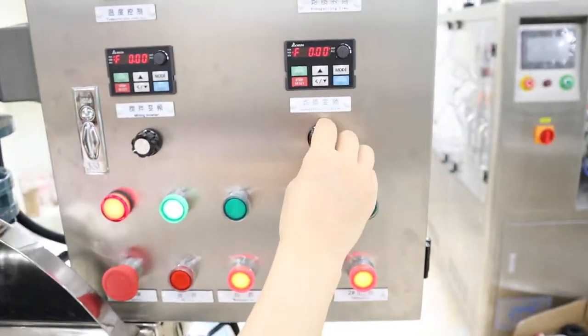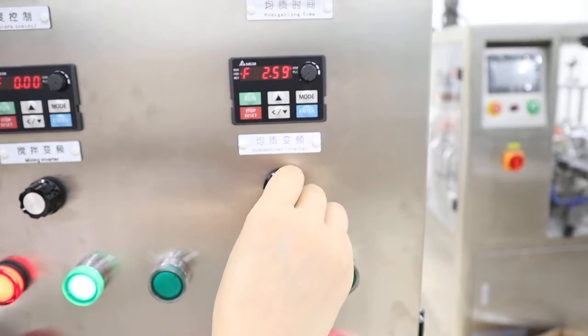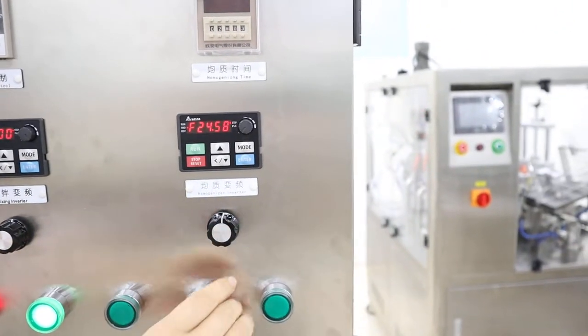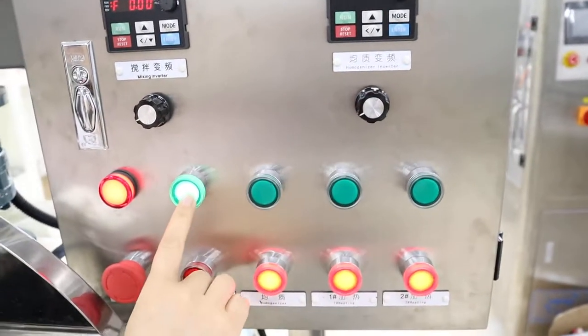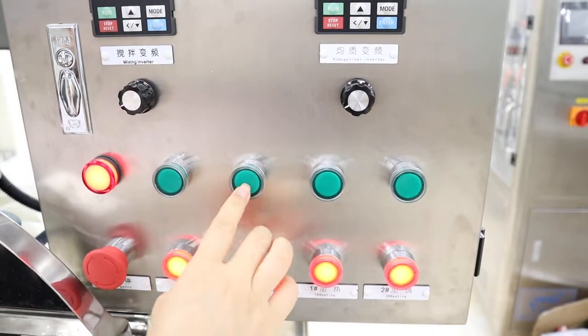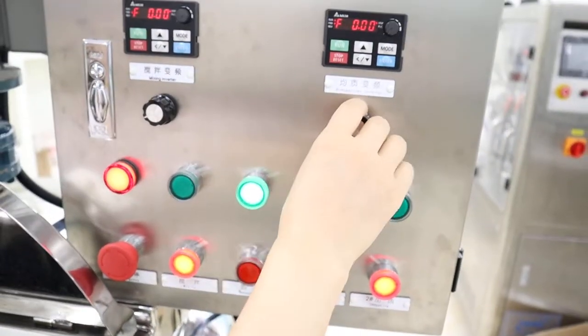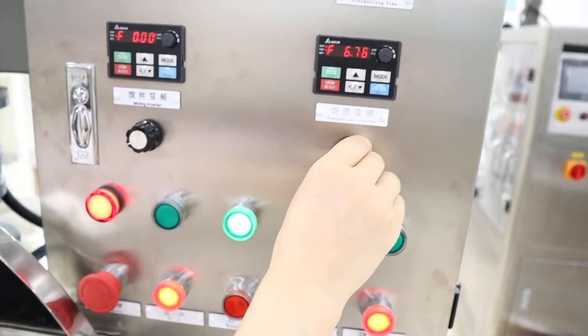The speed of the homogenizer also can be adjusted inside. Open the homogenizer first, then change the speed from here.